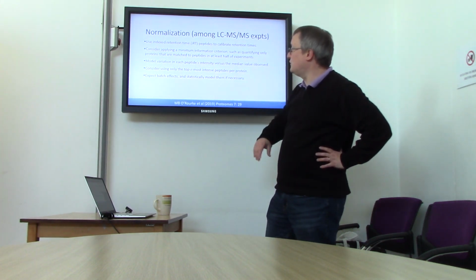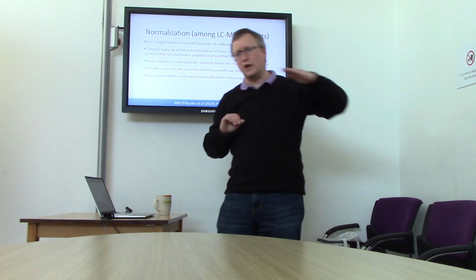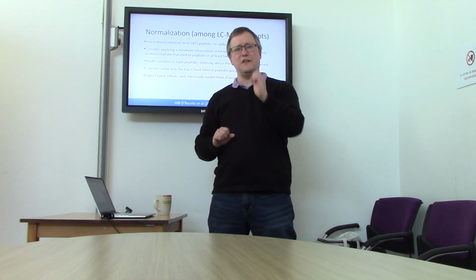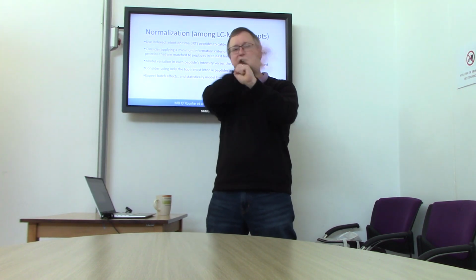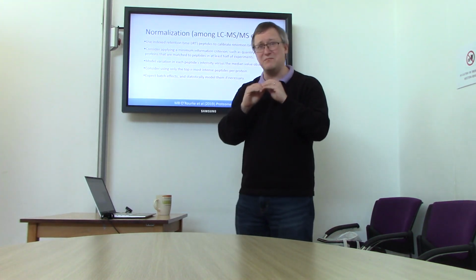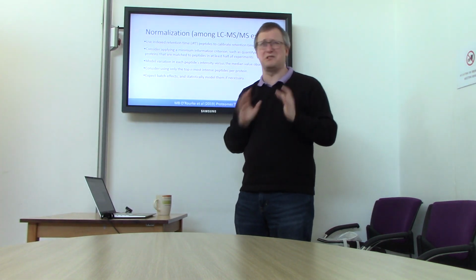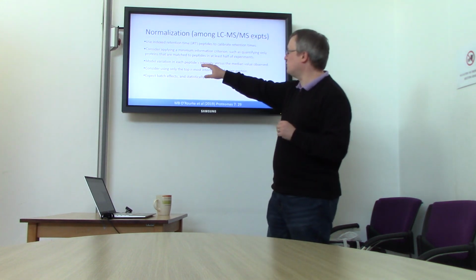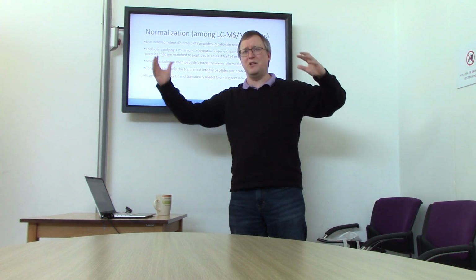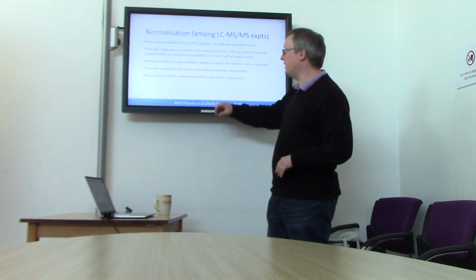It is appropriate to model the variation in each peptide's intensity. It might be that if you look across the row for a particular peptide's XIC values, the median value is right in the middle of the clump and there's nothing that really stands out way to the left or way to the right. That's a good case. But it might be that you see some outlier values in intensity for this particular peptide that could really screw things up if they're allowed in there. So doing some normalization to try to either coerce these peptides to a more sensible distribution or eliminate this peptide from consideration is appropriate.